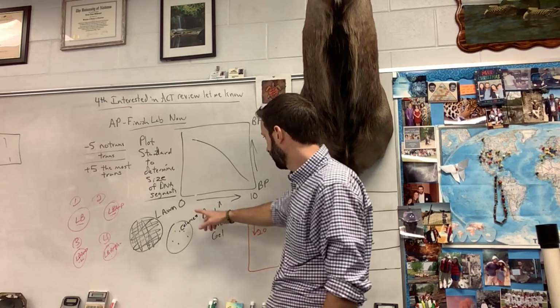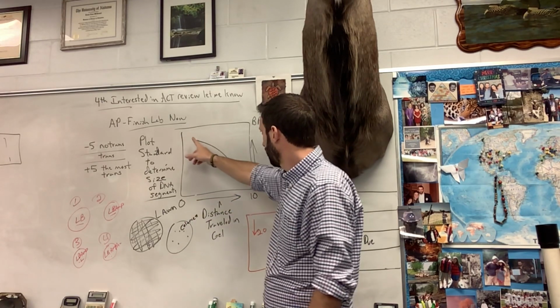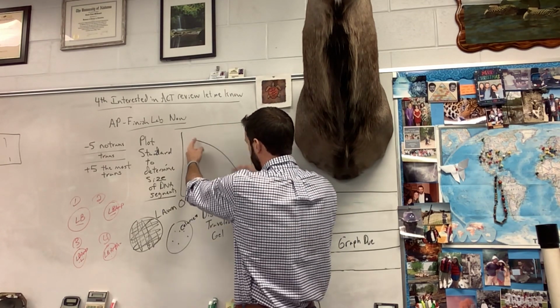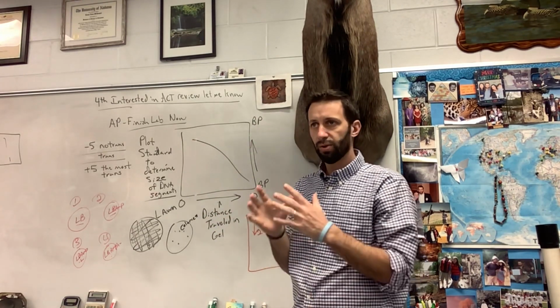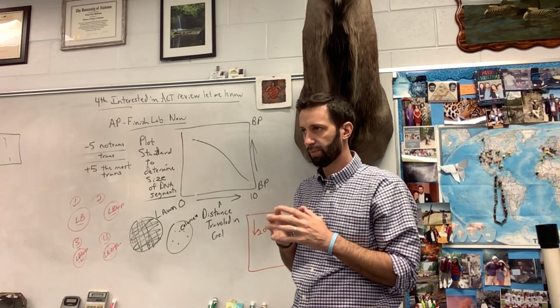And so you're gonna put the distance it traveled, and then you're gonna plot a point, and then you'll use that and how big it is and plot a bunch of points. And once you get those points plotted, you're gonna make a smooth curve from it, okay? And so that is what you're gonna use to figure out how big your other DNA segments are.